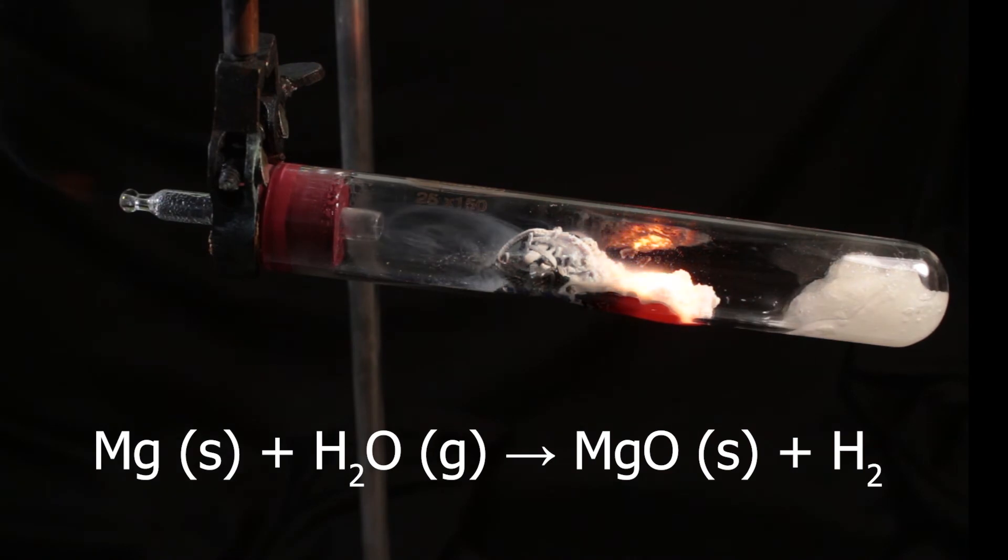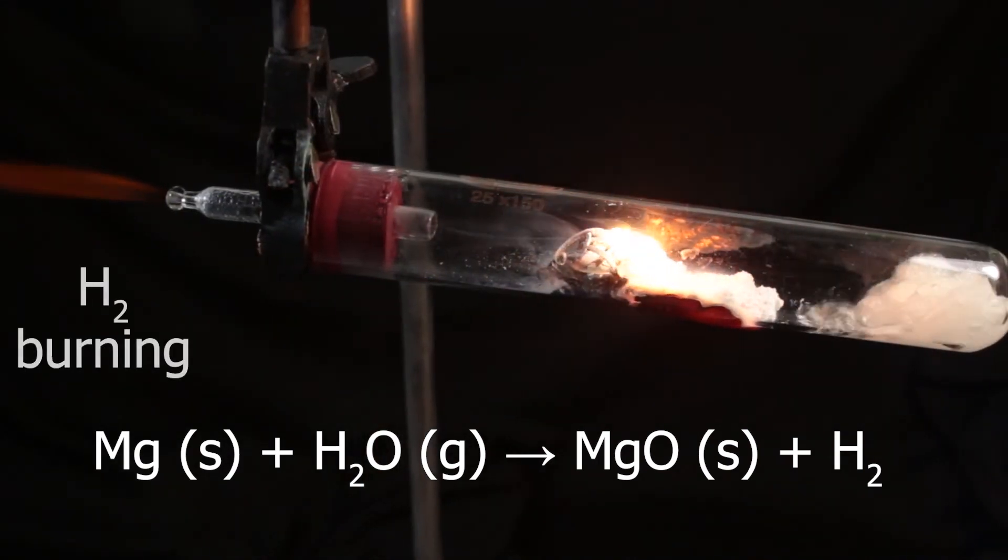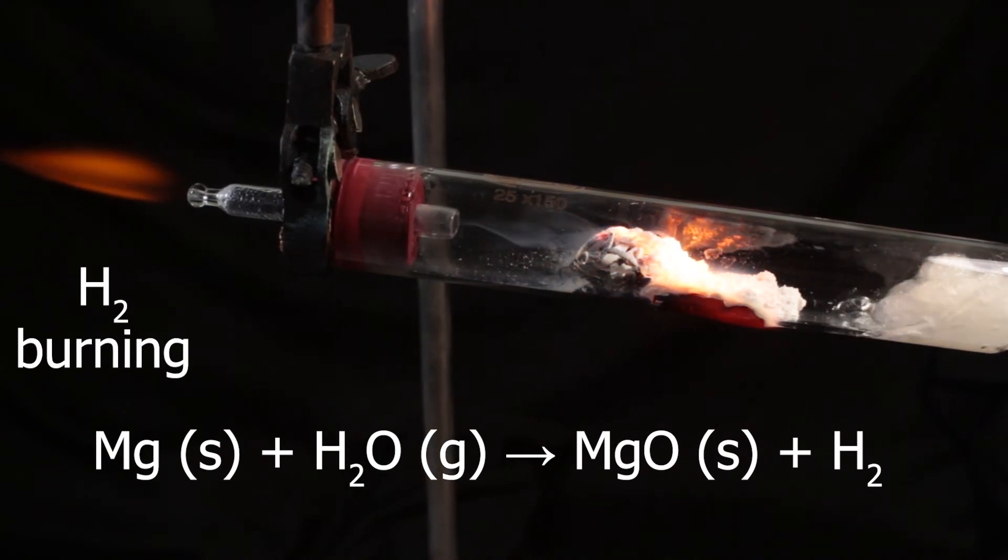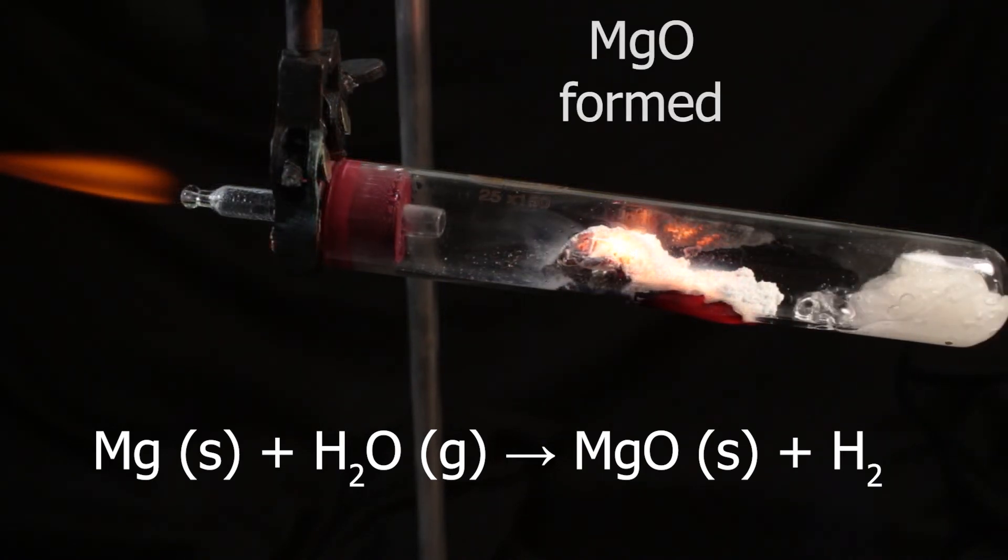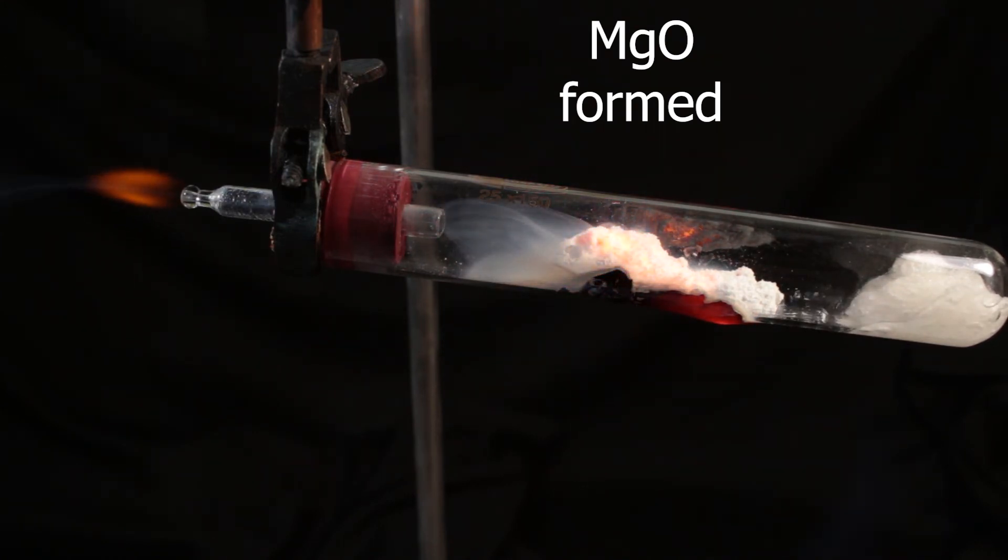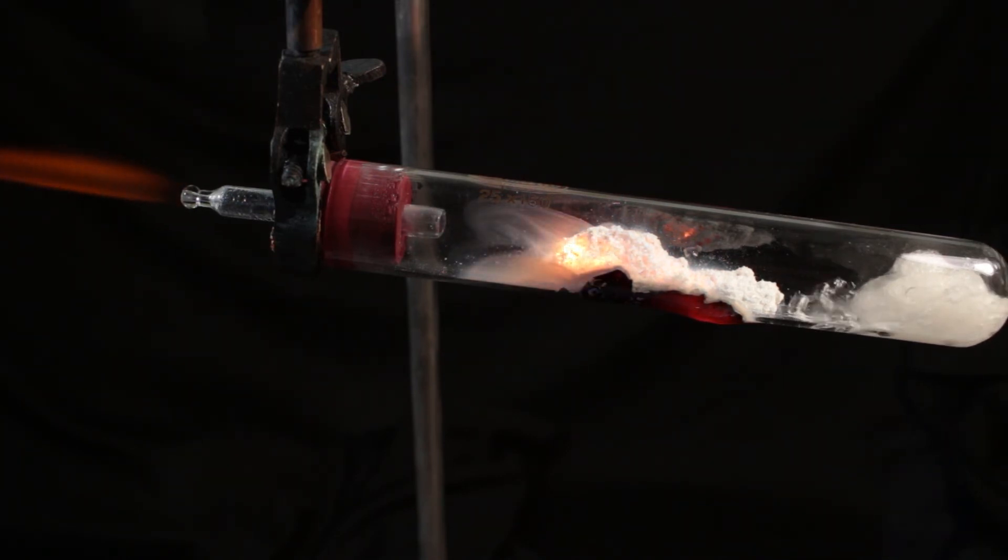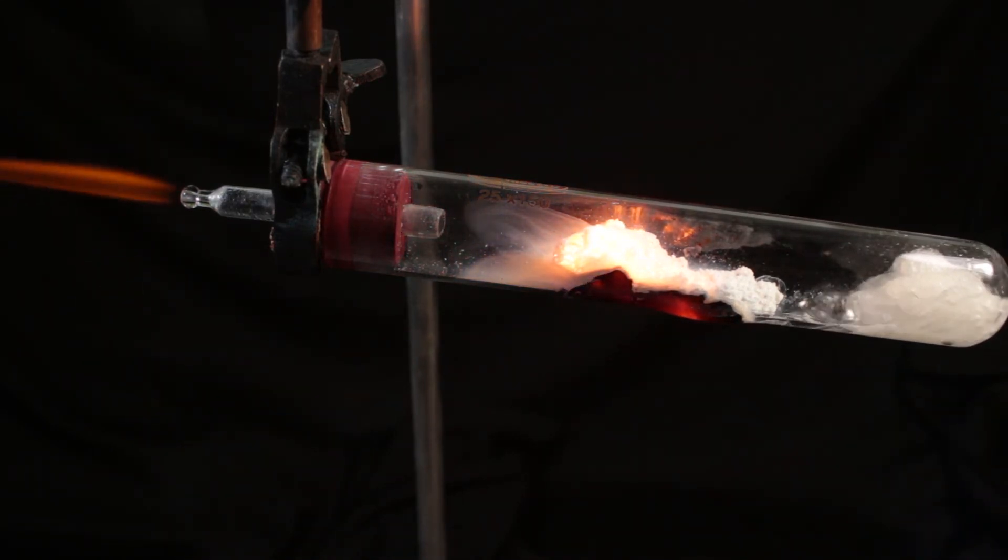Magnesium oxide is formed and hydrogen gas, which we can light up. Here is a jet of the gas. White substance is magnesium oxide. The rule of thumb is that when metal reacts with cold water, hydroxide is formed. When metal reacts with hot water vapor, oxide is formed. Hydroxide would decompose at these high temperatures.